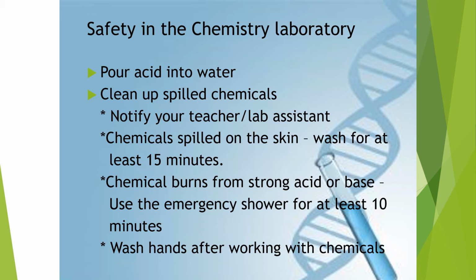Clean up spilled chemicals. Notify your teacher or lab assistant. In case of chemicals spilled on the skin, you wash it for at least 15 minutes with soap and water. For chemical burns from strong acid or base, use the emergency shower for at least 10 minutes. You wash your hands after working with chemicals.